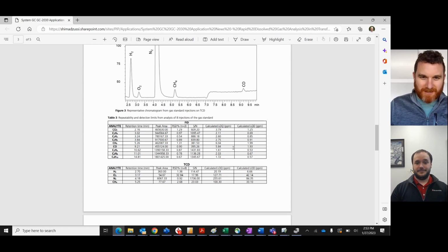Yeah, your RSDs are well below 2% for the FID. That's great. For a headspace method too, that's really good.